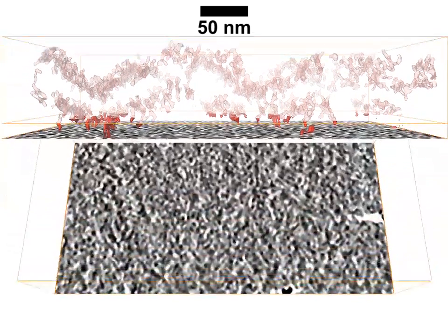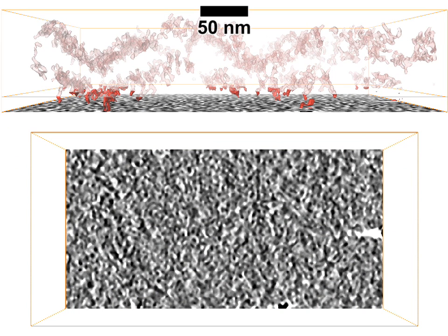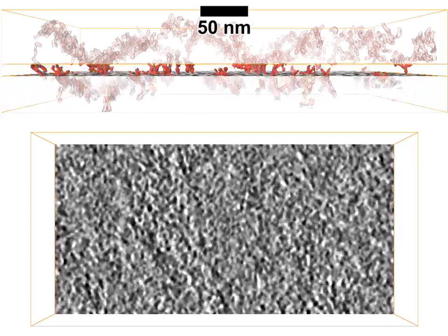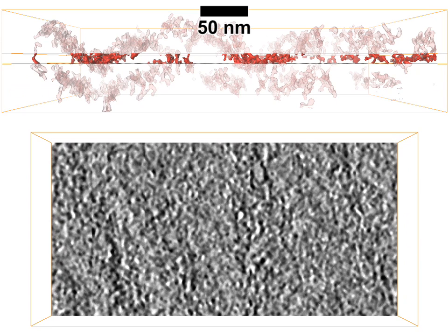Here the slice-by-slice close-up is shown below the isosurface. Each slice corresponds to a projection of the densities highlighted in solid red. The projected slice and the corresponding isosurface densities are concurrently translated from the bottom to the top of the tomogram.